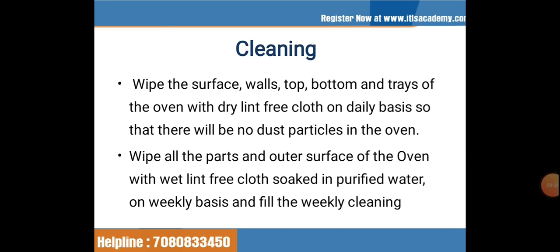The next is the cleaning. It is a general procedure one should know about the instrument. The cleaning can be done: you have to wipe the surface, walls, top, bottom, and trays of the oven with dry lint-free cloth on daily basis so that there will be no dust particles in the oven. Wipe all the parts and outer surface of the oven with wet lint-free cloth soaked in purified water on weekly basis and fill the weekly cleaning.